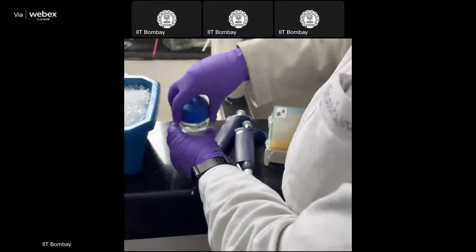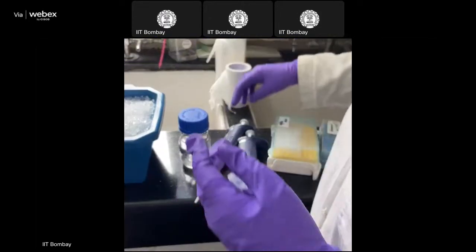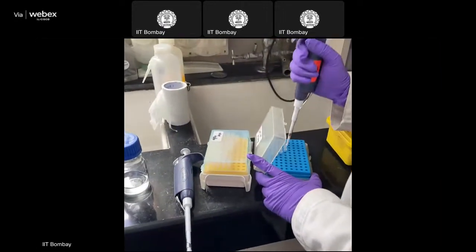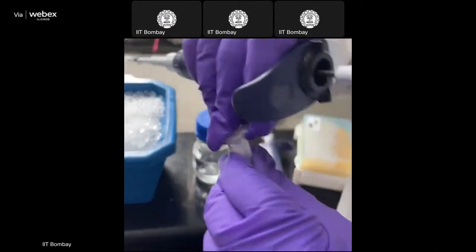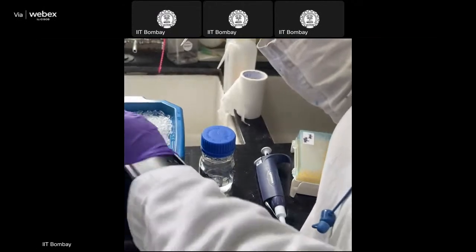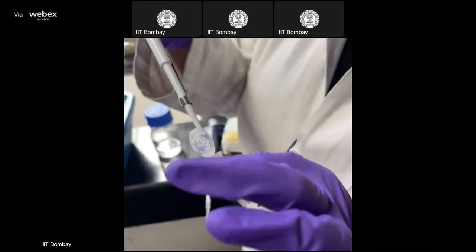After adding urea lysis buffer, one component that we are adding is PIC. So what is PIC? It is a protease inhibitor cocktail. PIC will inhibit the proteases so that they won't affect our protein and our protein will be safe. So I'm adding the PIC in a 1:10 ratio. If I'm adding 200 of buffer, then I'm adding 20 of the PIC.